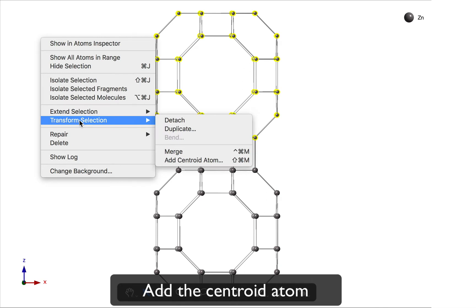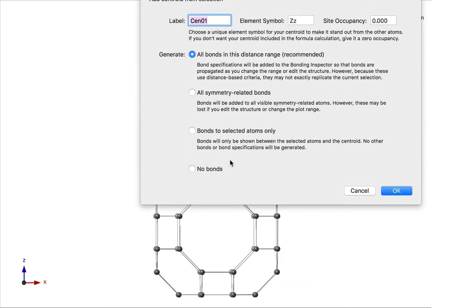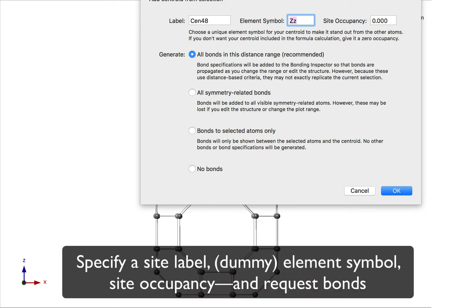We do transform selection, and we're going to add a centroid atom. Now at this stage we're prompted for some parameters. We need a label. I'm going to call this centroid 48 because it's a 48-vertex polyhedron. We need an element symbol. Now it's useful to use a dummy element symbol so you can easily differentiate your dummy atoms from the regular atoms.